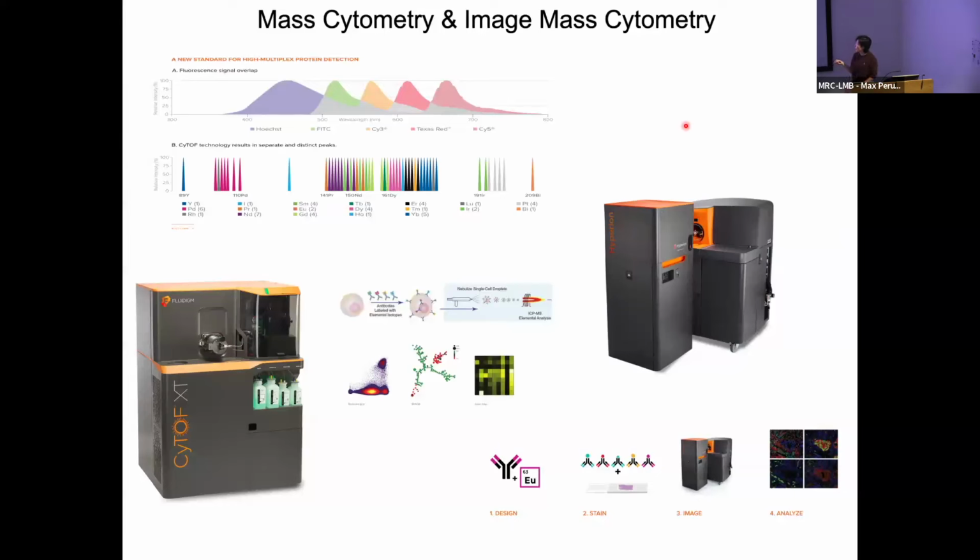And also there are mass cytometry and imaging mass cytometry. Again, we can get access to them in CRUK. Mass cytometers use a metal tag rather than a fluorescent tag on antibodies. It's particularly useful for large panels, for example with cancer patient samples, where you have a very limited amount of sample. And the metal tag reduces the spectral overlap, so it makes analyzing the sample easier. However, it also comes with disadvantages. For example, it's very slow.